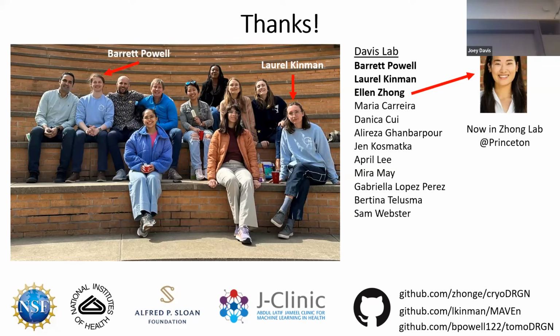Are you incorporating any kind of assumptions or priors? Because it looked like those motions seemed very natural. It's a variational autoencoder, so the only regularization is in the loss that you calculate, which has two terms. One is the reconstruction loss, which is the difference between the two images, and then there's a KL divergence loss, which is the difference between the unit Gaussian and where you project. So you're penalized for pushing things apart really far in latent space, and that gives you some degree of regularization that makes these things look much smoother. It helps with some of the overfitting.